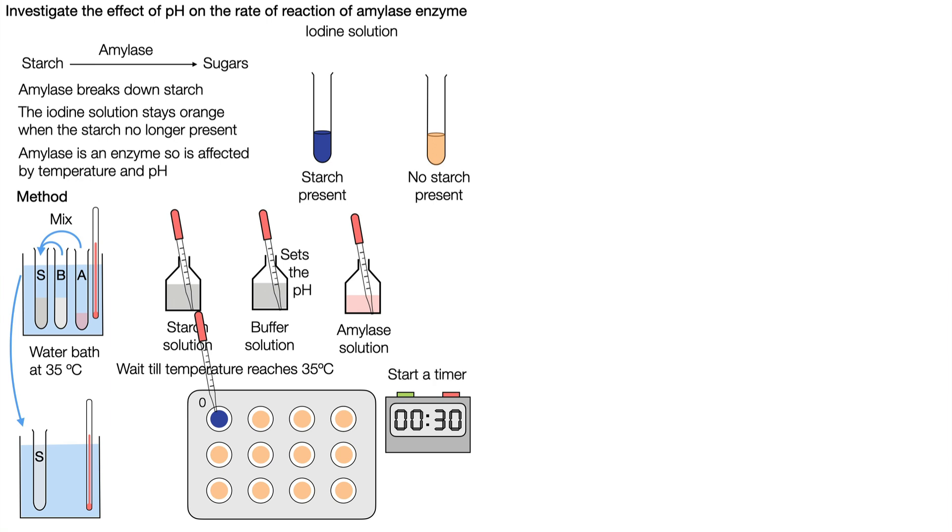We would start a timer immediately and after 30 seconds we would take a second sample and you can see there is still starch present there, and every 30 seconds we would add a drop to our iodine solution in the spotting tile.